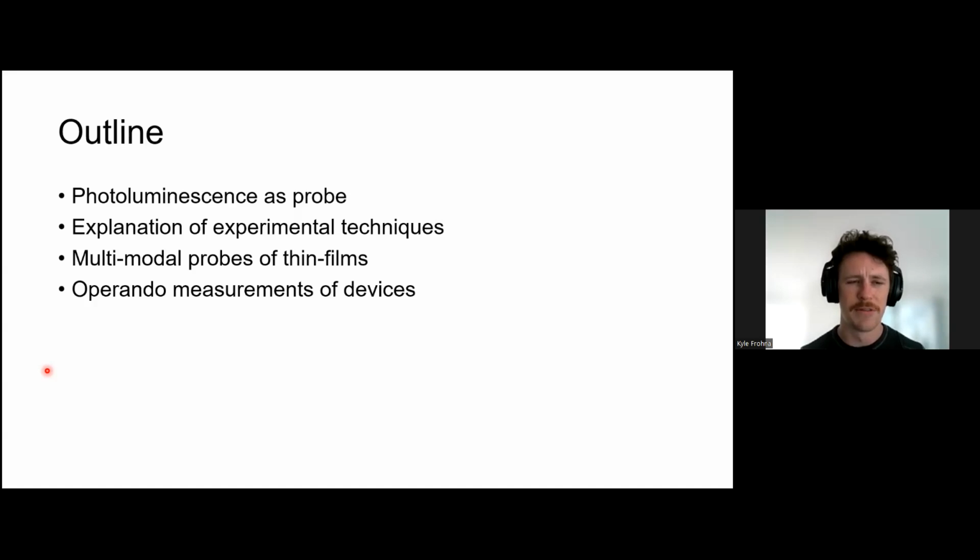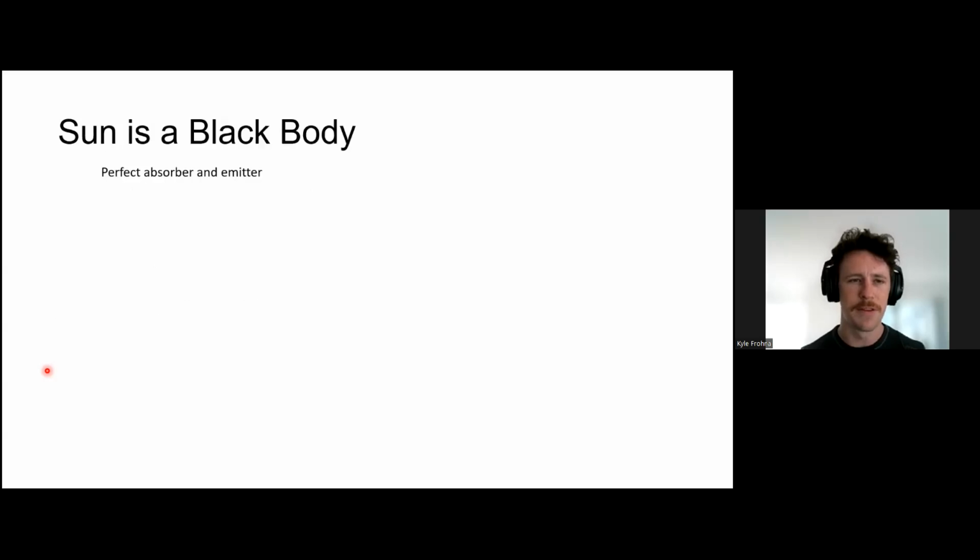Then we'll finish off at the end by extending this framework to operando. What can we learn when we operate a device and point all these different microscopy techniques at it? And then a few conclusions.